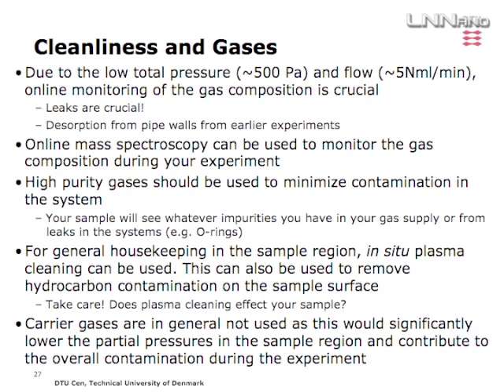Quite often when people do reactor experiments, they would use carrier gases because many labs don't allow you to flow 1 bar of say hydrogen. So they would dilute it in an inert, say helium or argon or nitrogen or something like that. We prefer not to do that. We prefer to stick to the pure gas because we don't want our total pressure to become too high.